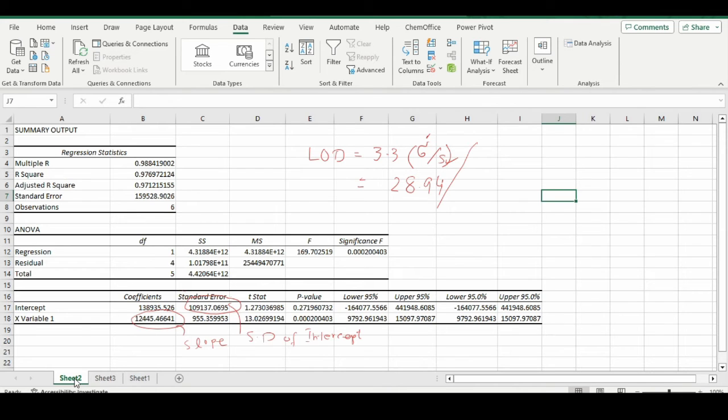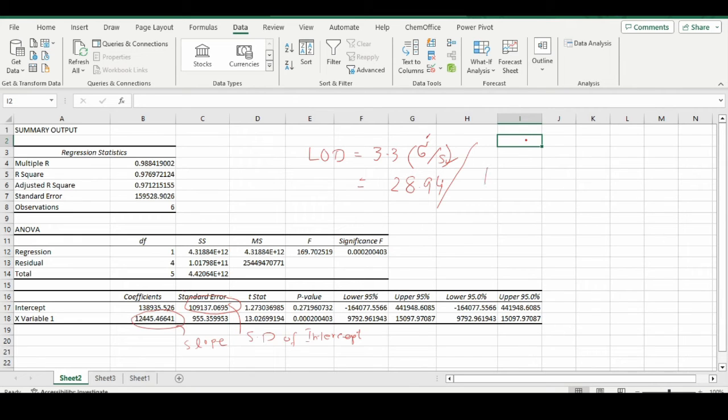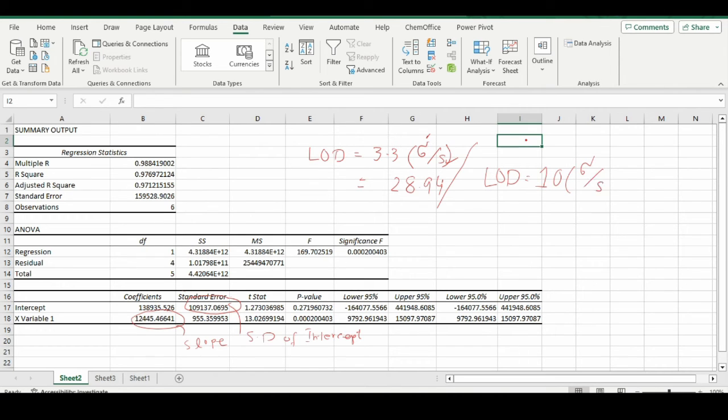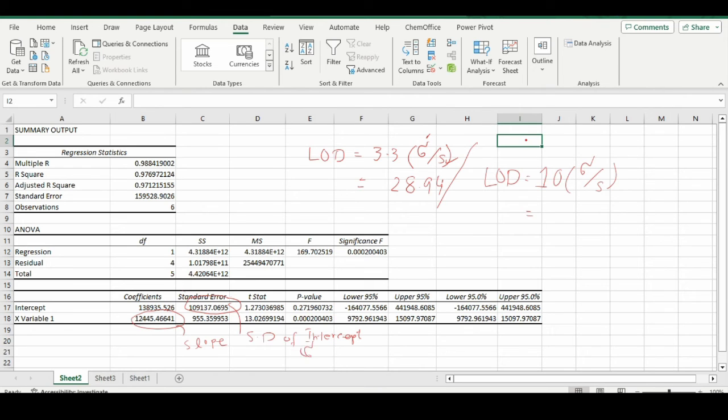For LOQ, the limit of quantification, its formula is 10 times sigma over s. Similar to before, sigma is our standard deviation—the standard deviation of intercept—and s is the slope. The value would be 87.70.